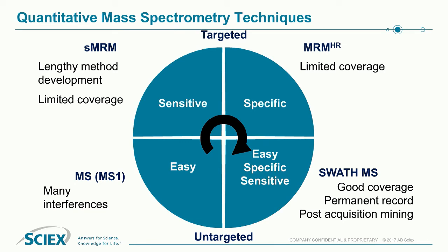The second method as we move around is by far the most sensitive method. This is the SRM or MRM based method, which is based on triple quadrupole technology. It does have a lengthy method development, but that's fine if you're going to use the assay for many, many years, but it also has very limited coverage. Just like ELISAs, this would be a very focused and very targeted assay where you would not see anything else in the sample appear which you had not built the SRM method for.